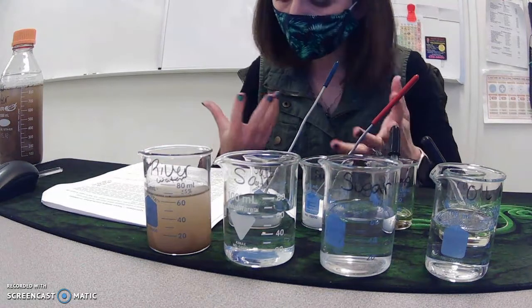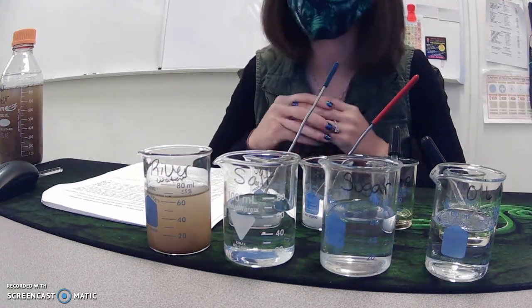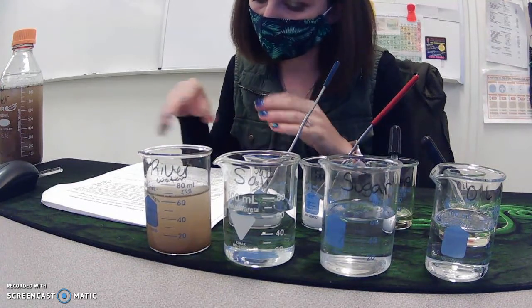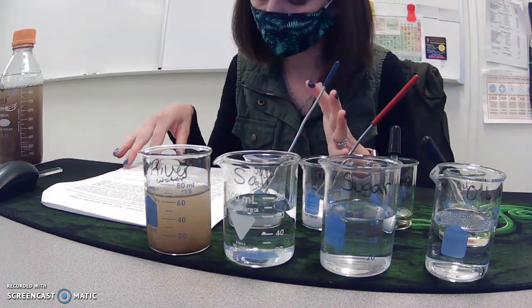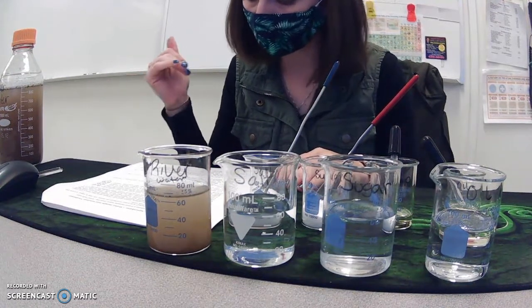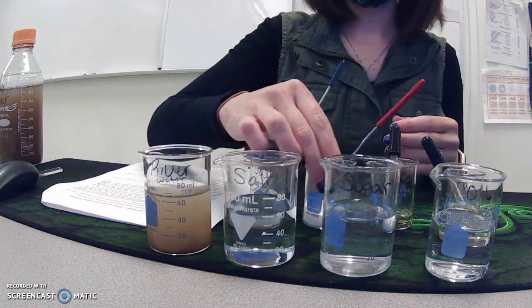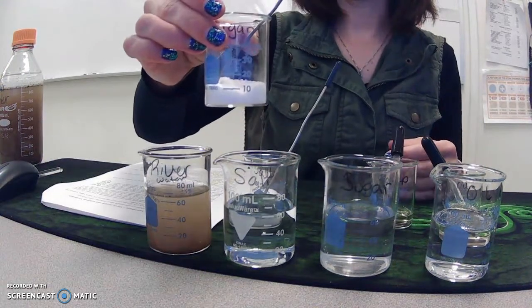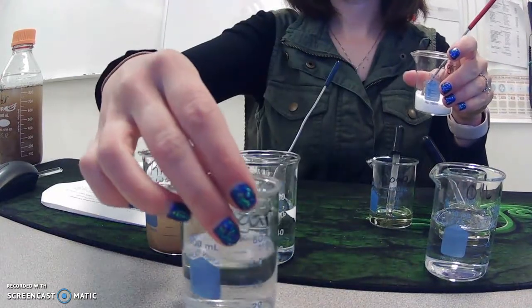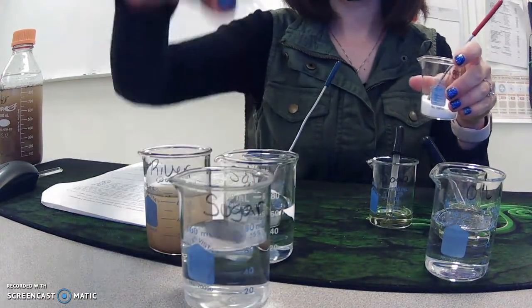Next, we want to test some polar molecules. Polar molecules are something that dissolve in water. They have partial charges. So we're going to add a scoop of sugar to the second beaker, and we're going to stir it into the water and see what happens. So here is our sugar. We're going to add it to our sugar beaker here and see what happens.